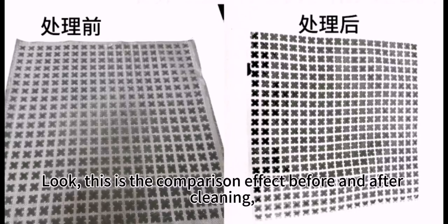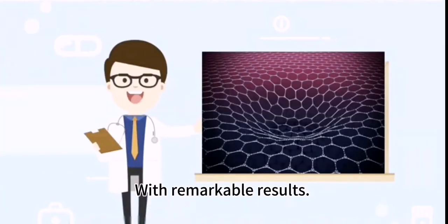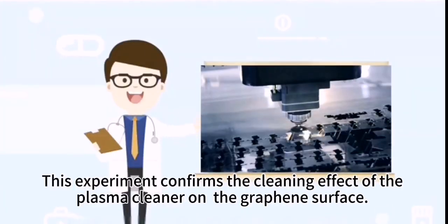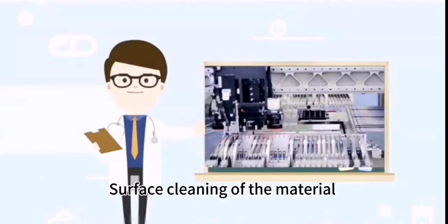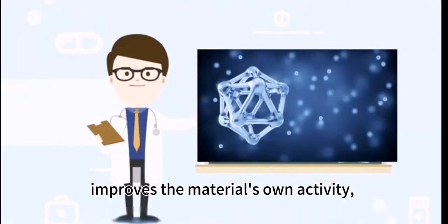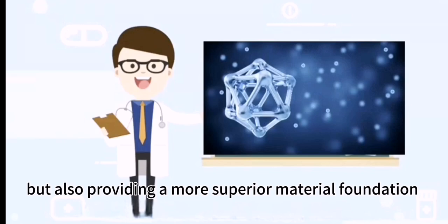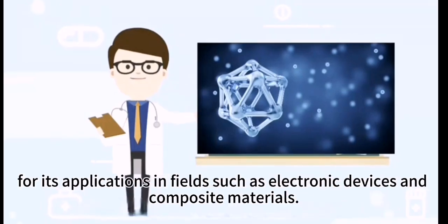Look, this is the comparison effect before and after cleaning, with remarkable results. This experiment confirms the cleaning effect of the plasma cleaner on the graphene surface. Surface cleaning of the material not only enhances its visual appearance and improves the material's own activity, but also provides a more superior material foundation for its applications in fields such as electronic devices and composite materials.